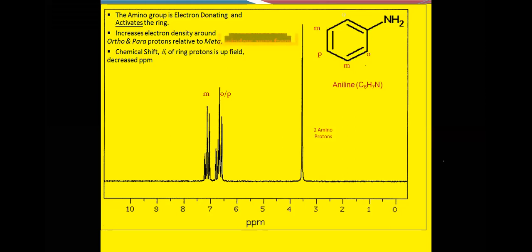Yes sir, very good. Look here again: in the amino group, two protons are there, the NH2 group, and for both protons there is no neighboring proton. So only a single absorption peak will be there at position 3.5 almost. The chemical shift of 3.5 gives only one peak. Which one? The NH2 group, meaning the protons due to the NH2 group.